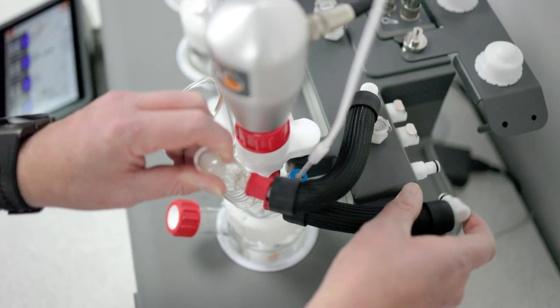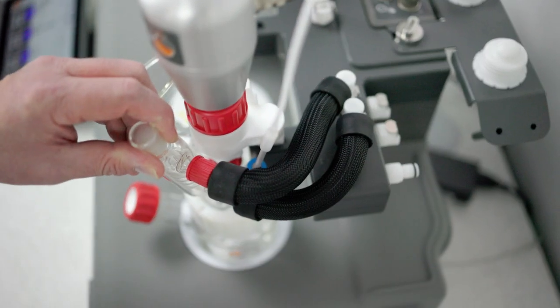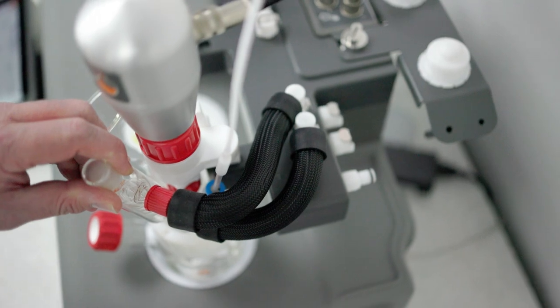The tubing has insulation and protective braiding, again eliminating the risk of condensation from the air.